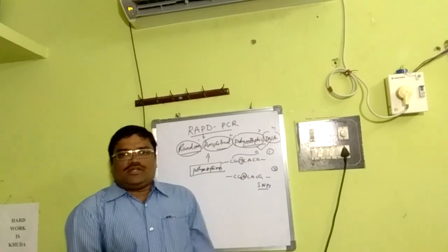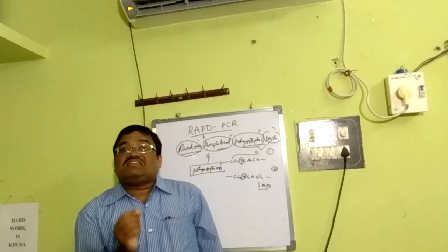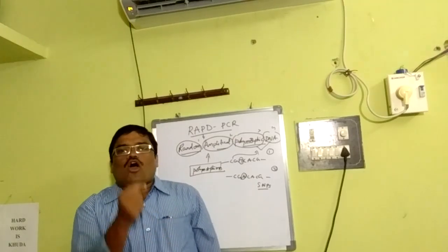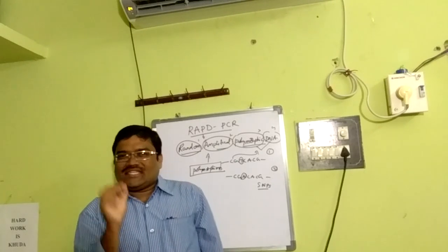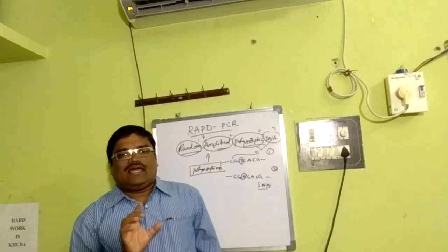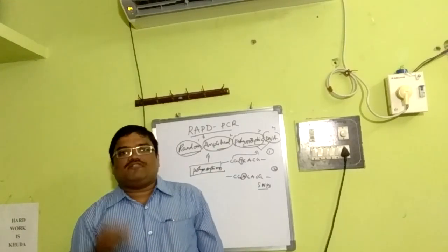Random amplification means PCR-enabled amplification. In RAPD, random amplified PCR fragments are the markers. Markers are DNA fragments of PCR-amplified random genomic DNA segments with a single type of arbitrary primer.